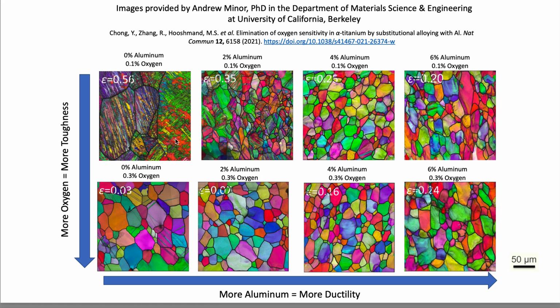And we notice here, just by visual inspection, that as the aluminum concentration increases, the size of these particles gets smaller and they become more dense per field of view. And the effect of adding oxygen also decreases the size of each crystal, each particle, but to varying degrees, a size of the particles.